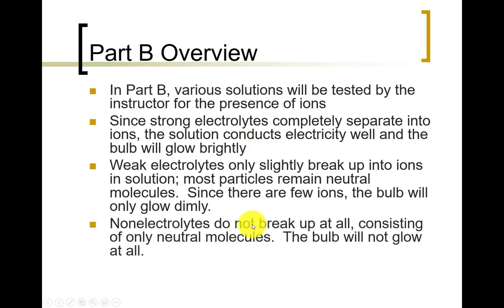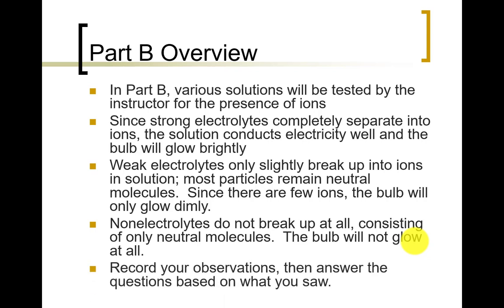And finally, non-electrolytes do not break up. They remain molecules that are neutral. And so when we go ahead and test this, we will see the bulb will not glow. As you watch this part of the lab, simply record your observations, and then you will answer the questions based on the results from those observations.